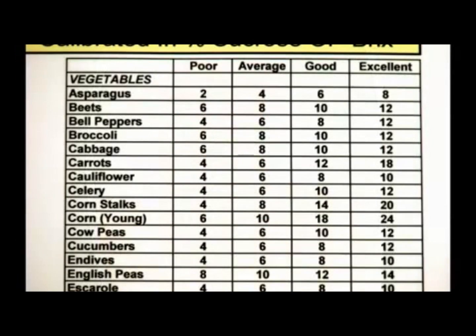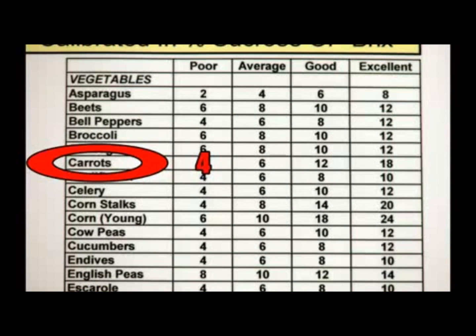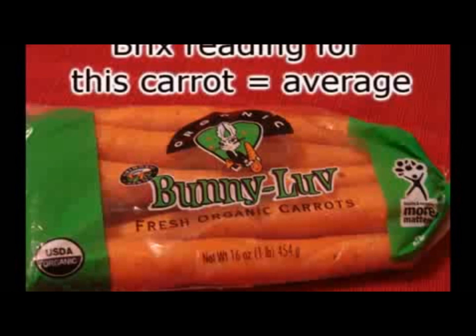Once we have the number from the refractometer, we can compare it to the chart which is here. Under vegetables we find carrots, and we see that a poor carrot is at 4, an average carrot is at 6, 12 is good, and 18 is excellent. This puts us in the range of having an average carrot on the upper side of average. I have seen Bunny Love carrots going 11 and 12 on their organic, but this one is not so good.